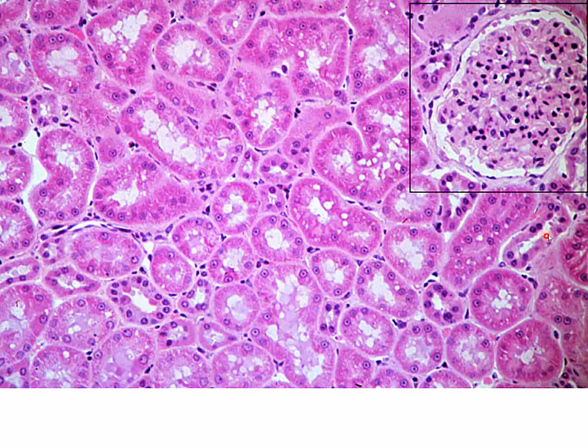And you can compare and contrast these in a number of places. Here's a distal, there's a proximal tubule. Now you're also going to see structures such as this, and this is going to be part of our peritubular capillary network. A lot of capillaries that are going to be around in and among all of our tubules, supplying them with the oxygen and nutrients that they need.